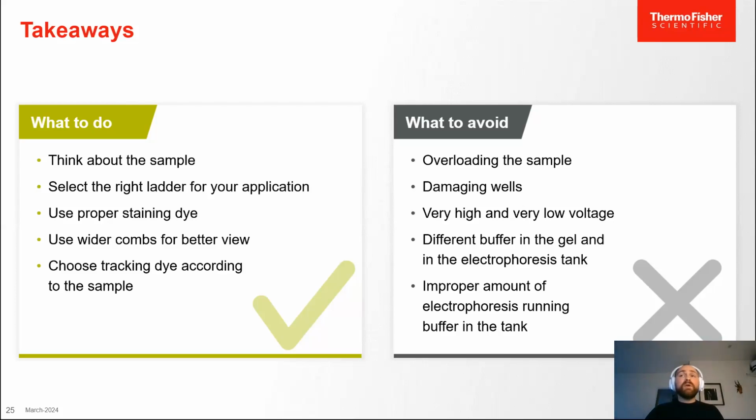We have very high and very low voltage, which has to be considered. Very high, you will have curved runs. Very low, you will have diffusion by the time that it runs.